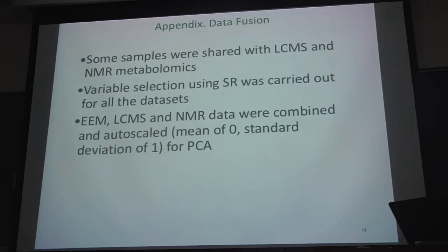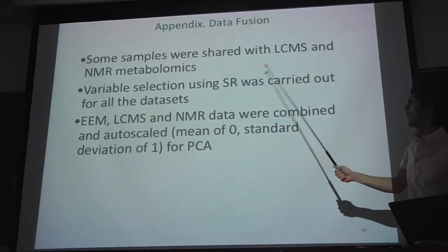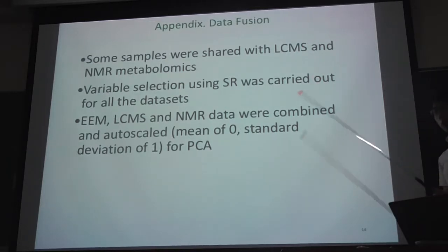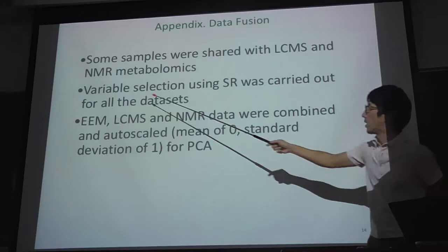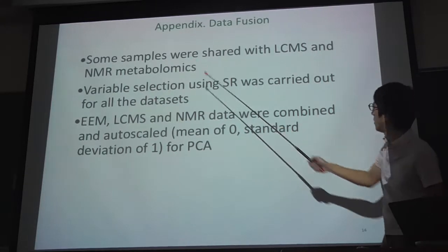And actually, we tried some further research because some samples were shared with LC-MS and NMR metabolomics. We tried the same variable selection on this data, LC-MS and NMR.